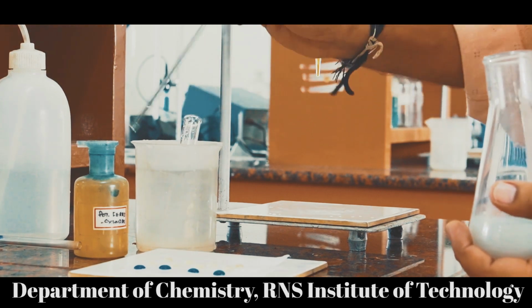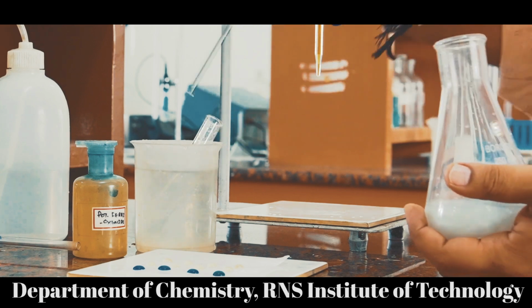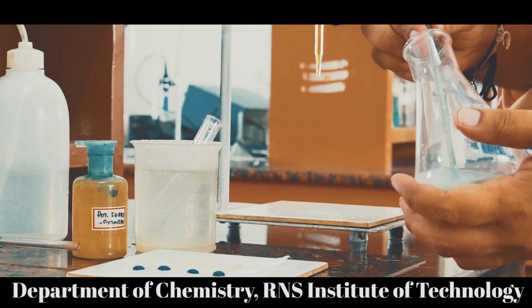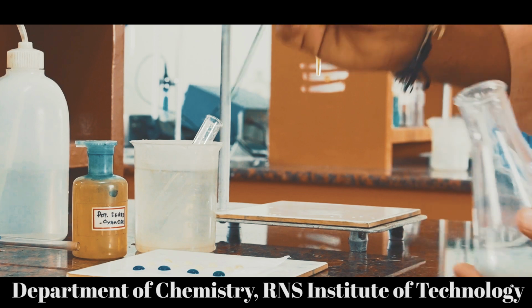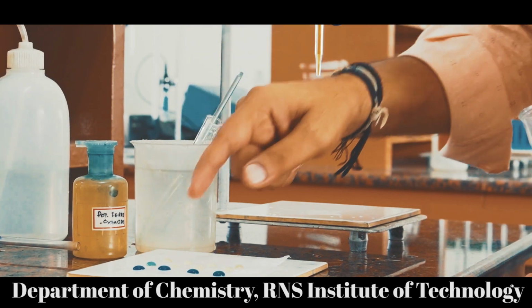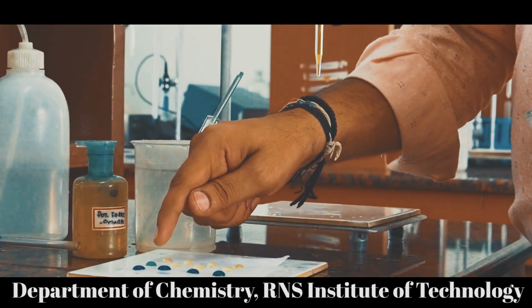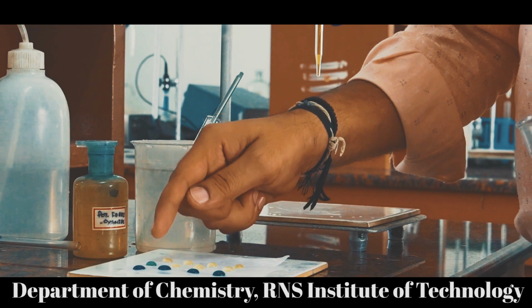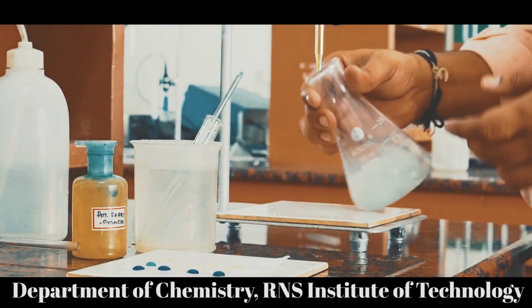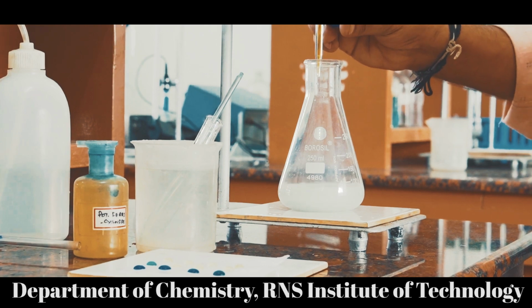Wash the glass rod properly, and then rinse it with this. Bring the reaction mixture in the same way into the next drop of the indicator. See, here you can observe the color intensity of this droplet is very light, right? This indicates that we are near the end point. So we'll add up to 12 now.